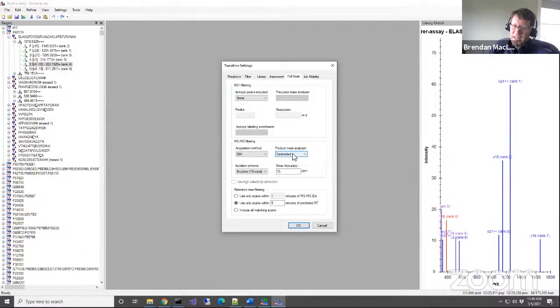That goes for Thermo and Bruker, which is a TOF instrument. But the Bruker TOF data is so big that it will be really slow to process. Both Thermo and Bruker files are stored in a way that they have the centroided spectra immediately available, so it's actually faster to process the centroided data, and we see good benefit.